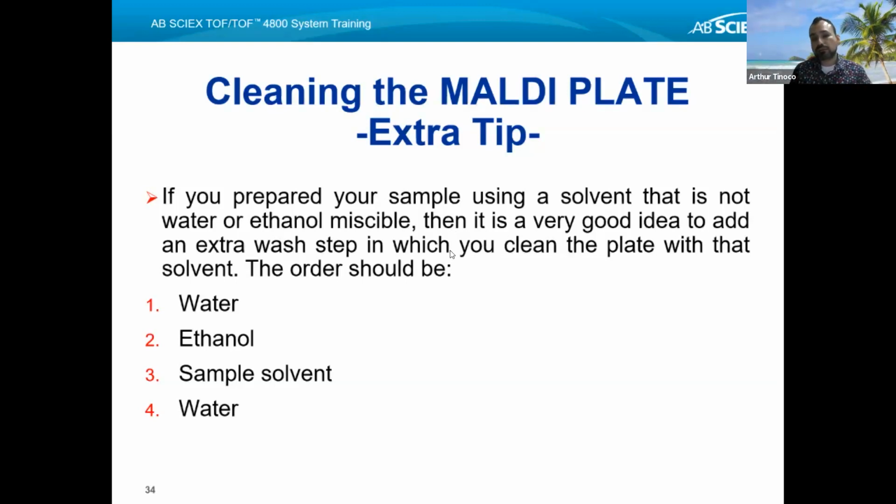So I would indicate this order, where you would wash the plate with water, then with ethanol, then the sample solvent that you use to make sure that all the sample is removed from the plate, and then go back and wash with water to ensure that everything is off the plate. Okay, so that will be the final touch that you do.